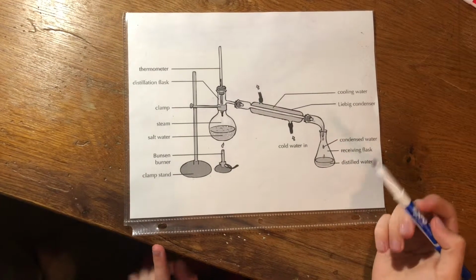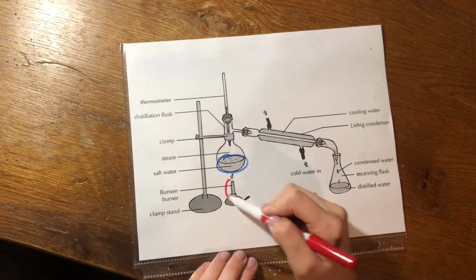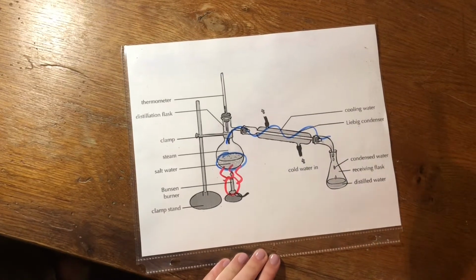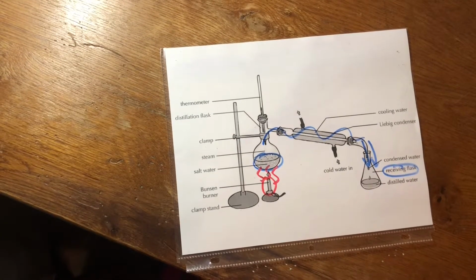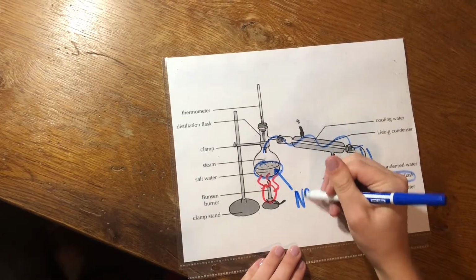The process begins with salt water in the distillation flask. The Bunsen burner heats up the salt water, and the vapor floats through the Liebig condenser. It is then collected as a liquid into the receiving flask. Now that the water has been evaporated, the only thing that would be left is the salt in the distillation flask.